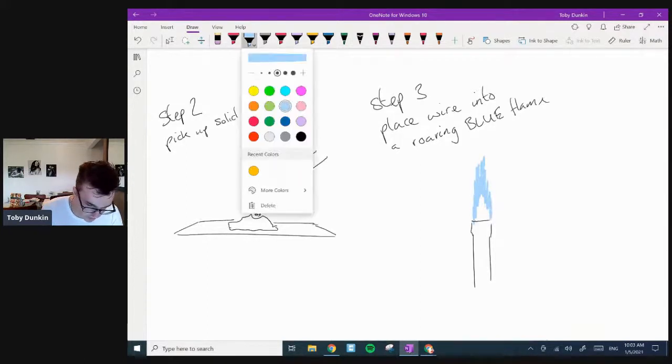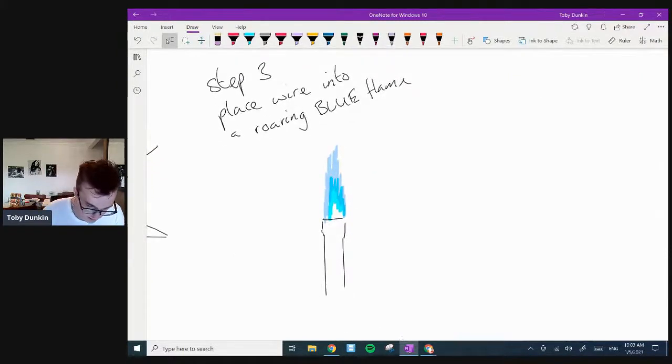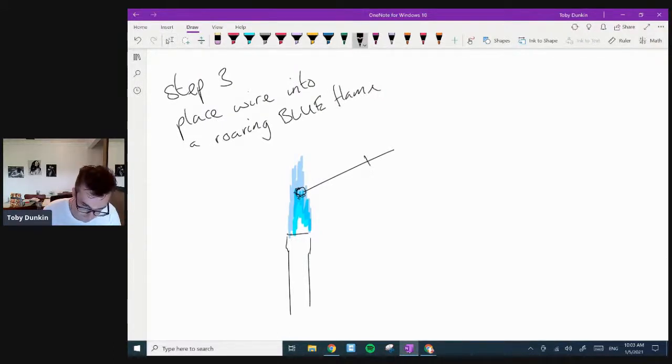The question to you is, why would you do it on a roaring blue and not a safety flame, not a yellow flame? There we go, the solid's on it. We're going to place it into a roaring blue flame.